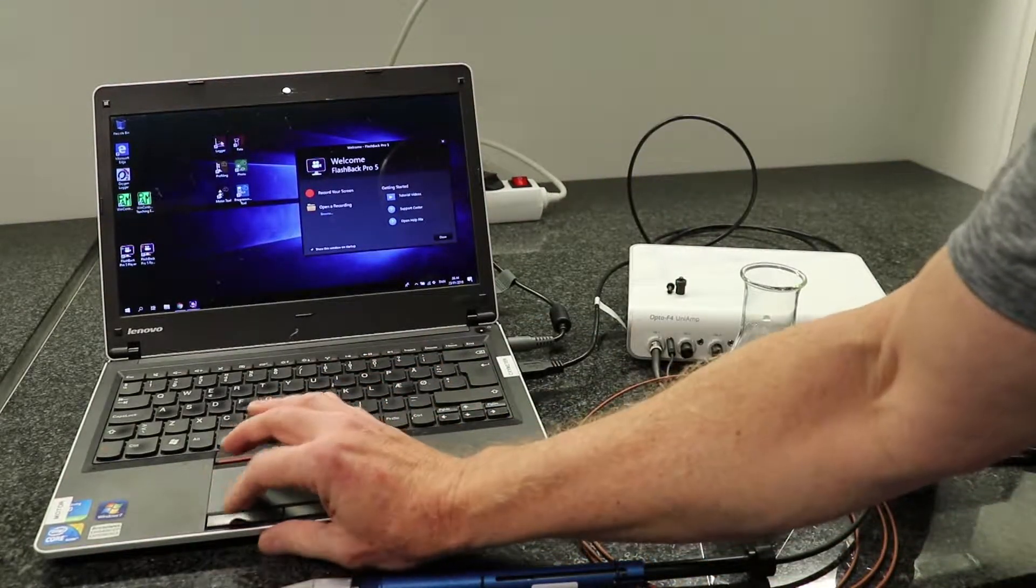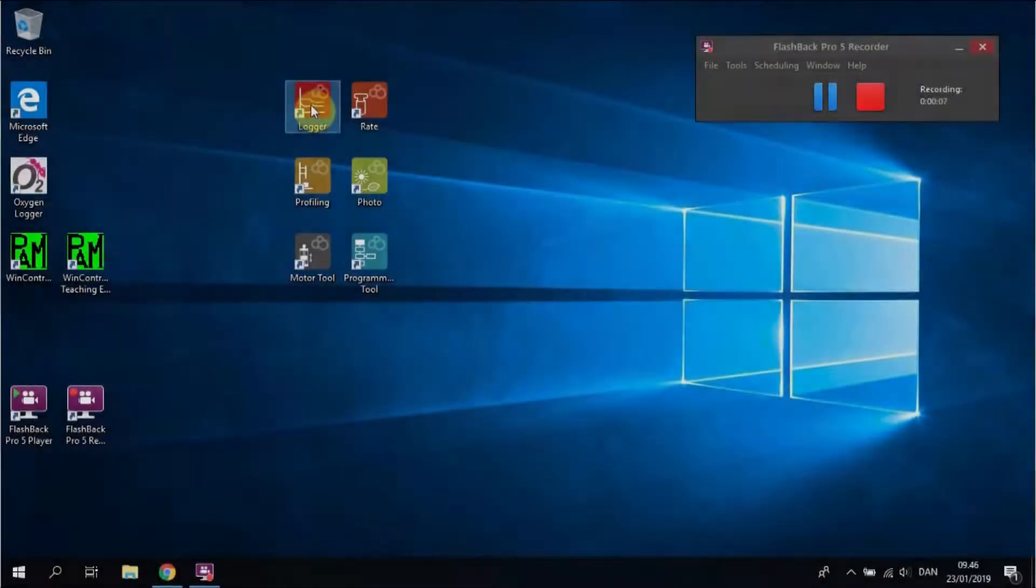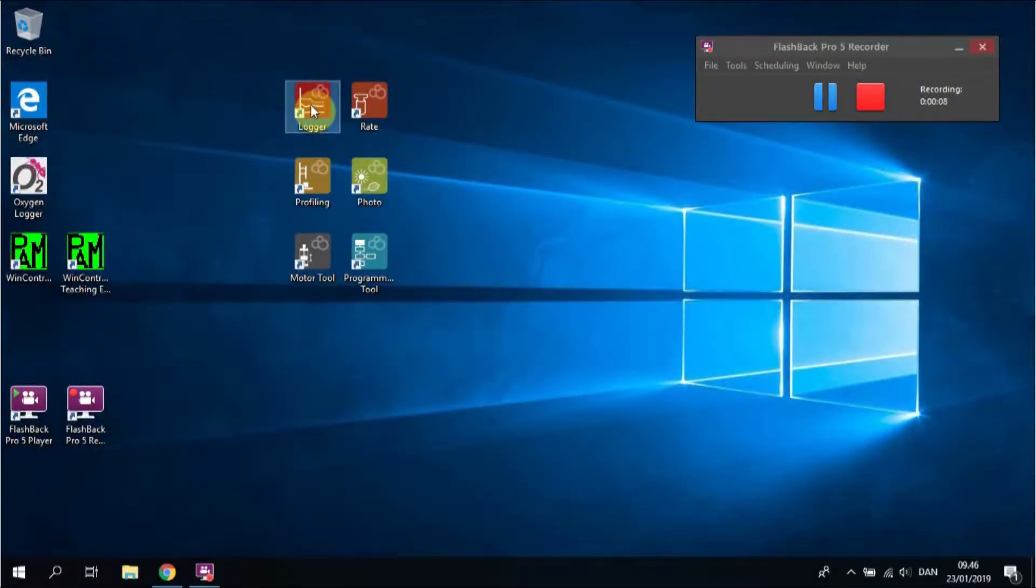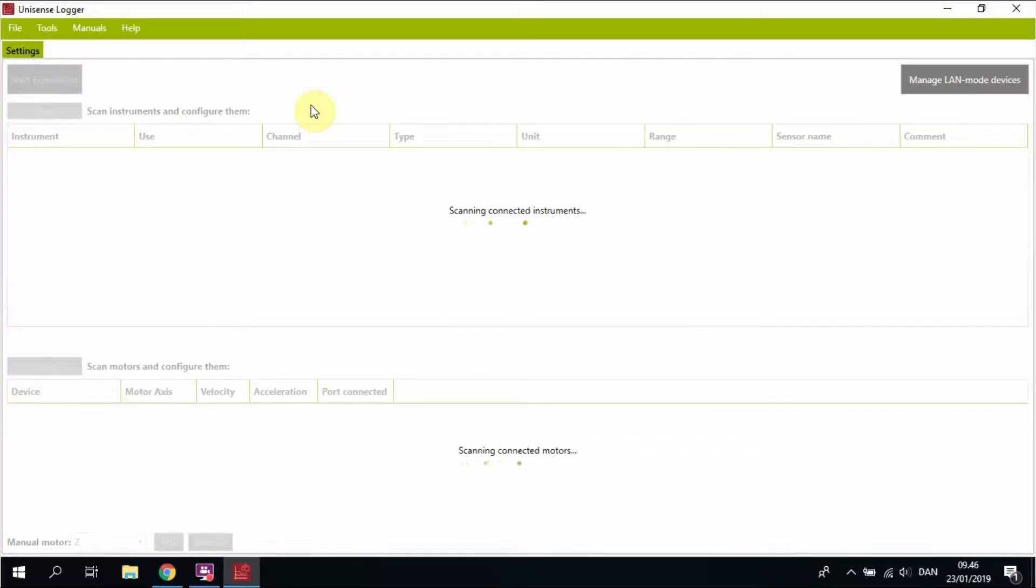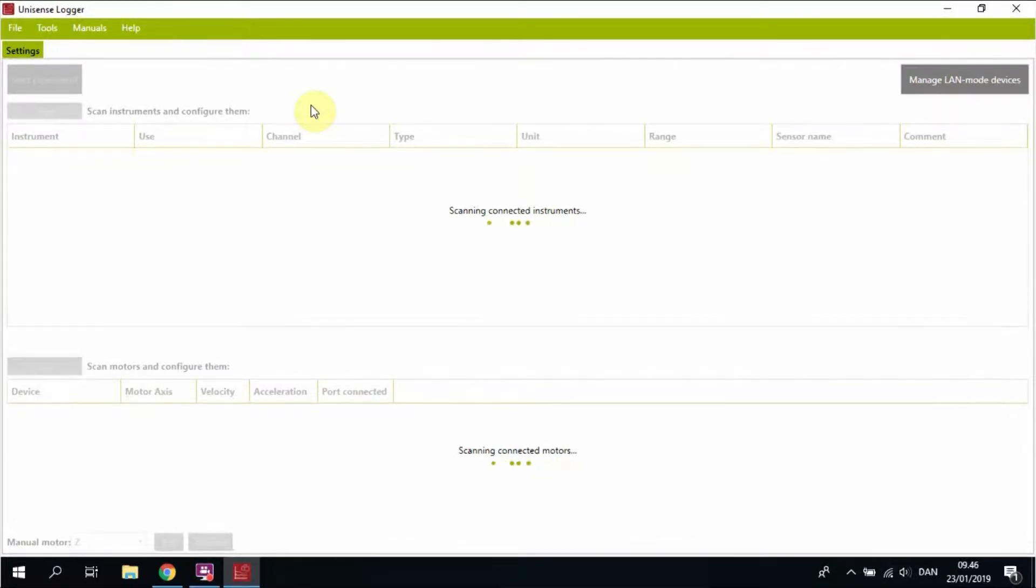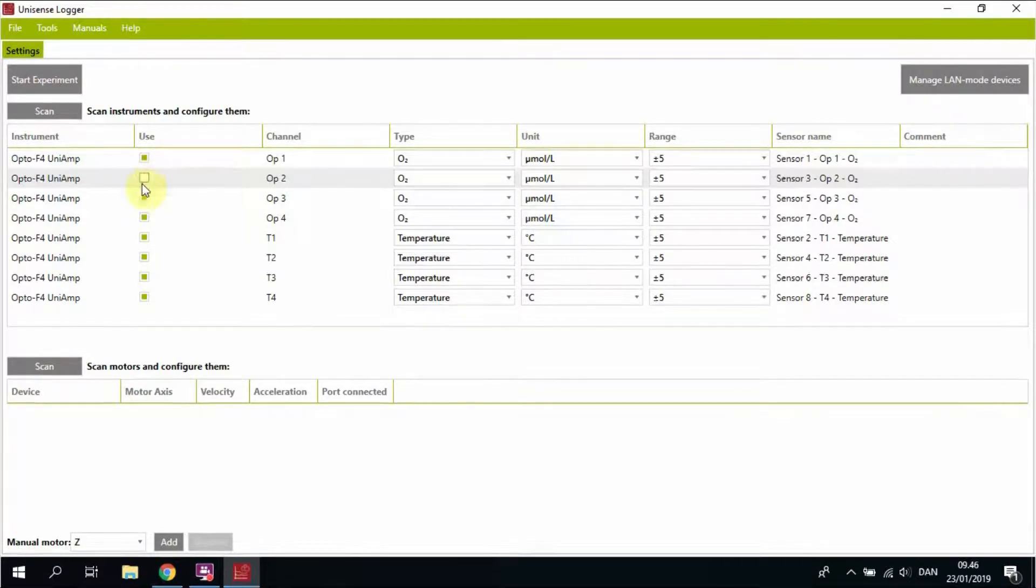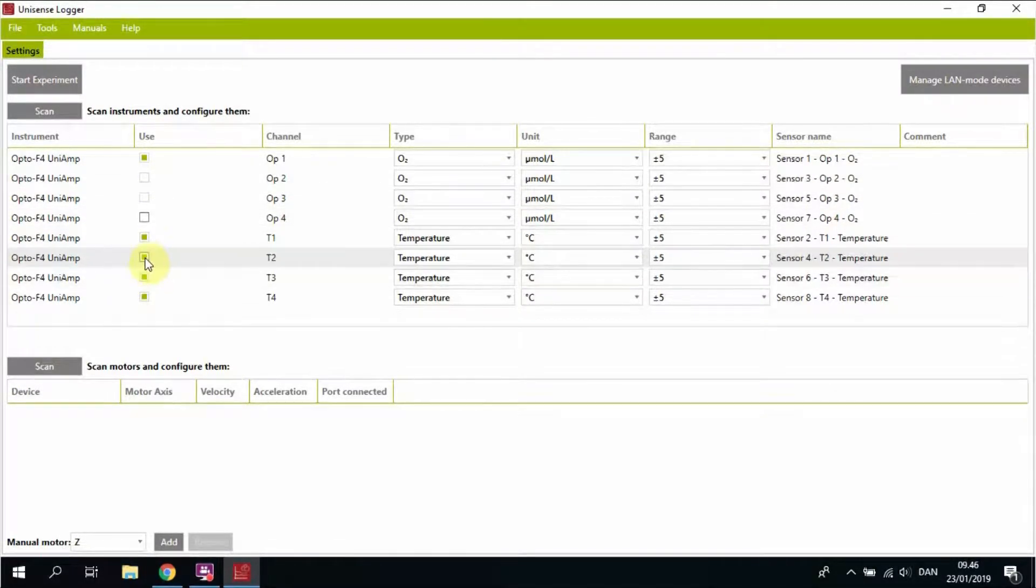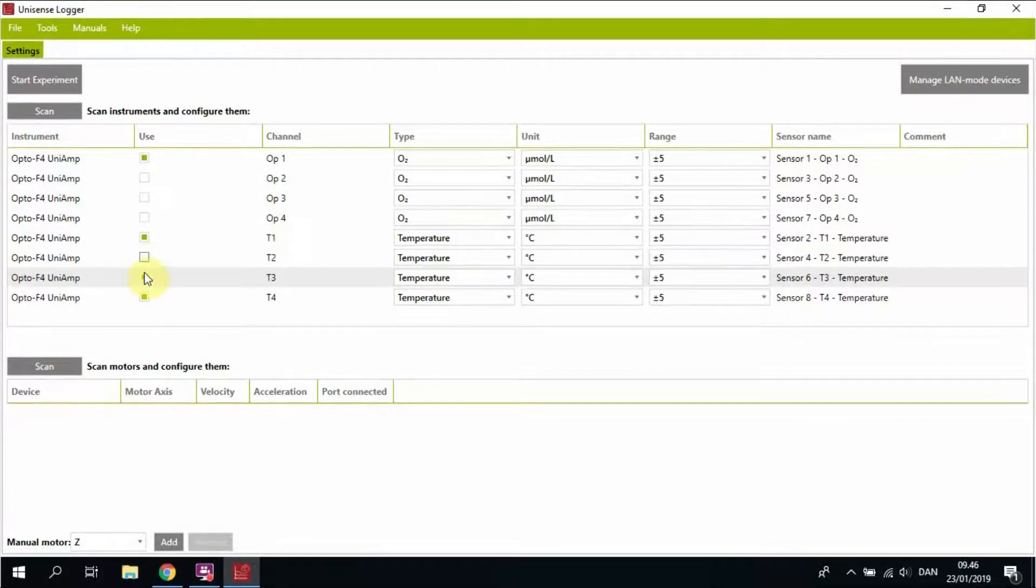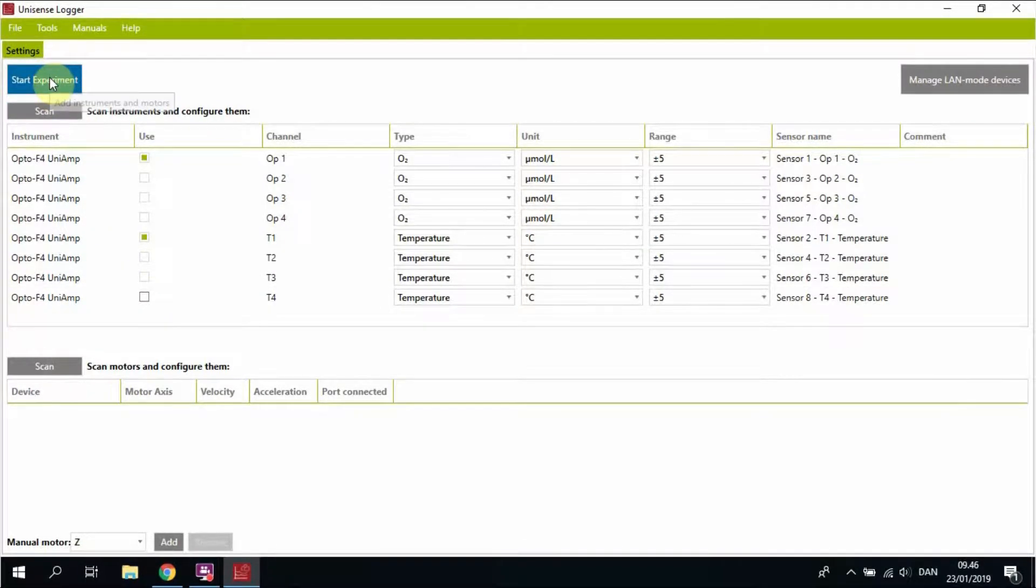Then you start up the logger software, the rate software, or the profiling software. Take some time for the software to find the connected meter. Disconnect the channels that you are not using in order to maintain overview. In this case we are only using channel 1 and channel 5.